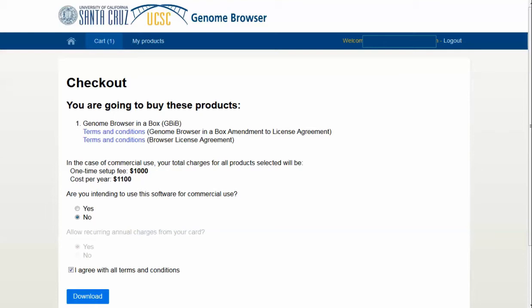Once you have it, you can set it up with the VirtualBox, set up the UCSC software, and you can be running. The last one I had was a testing version, so I'm going to download this one myself, and then I'll be back to talk more about the features of the Genome Browser in a Box.